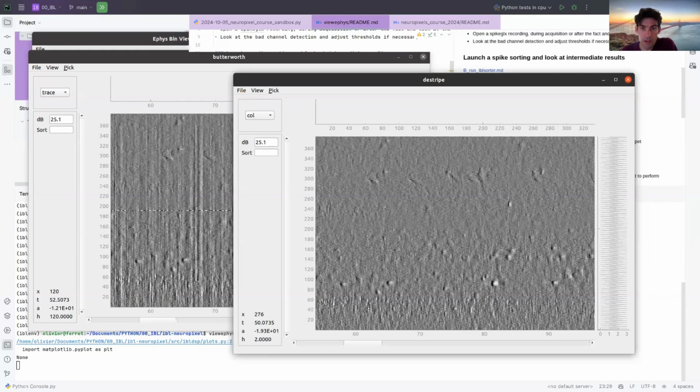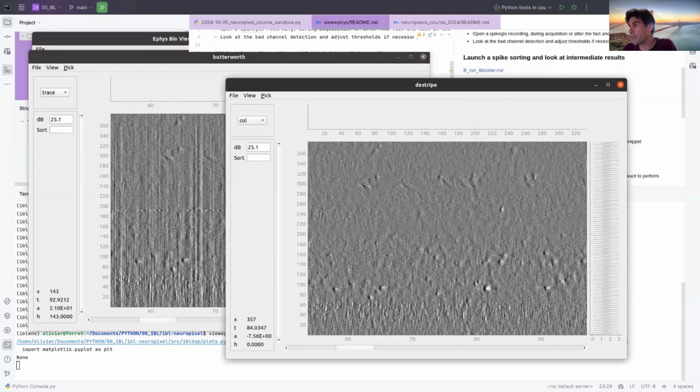I don't see lines and dots without distinguishing anything. Do you have any recommendations? Yeah. Can you see the spiking events here?